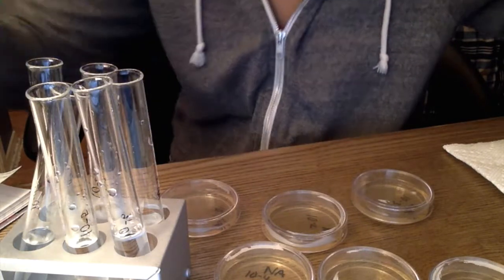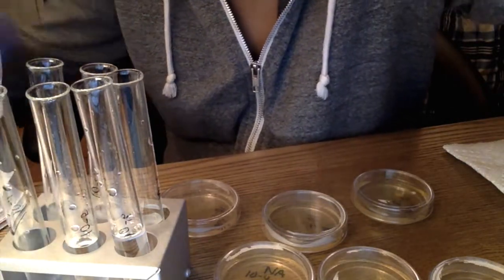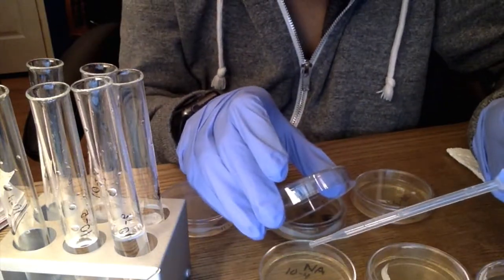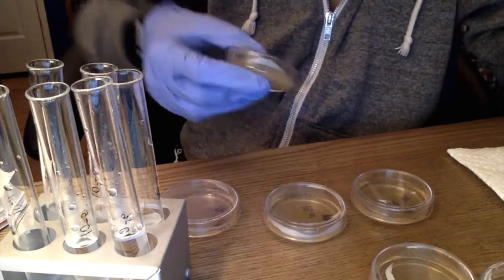cerevisiae colonies in each of these agar plates. I'll be able to tell the difference, since some of these are diluted, by the presence of more colonies than others in each plate.